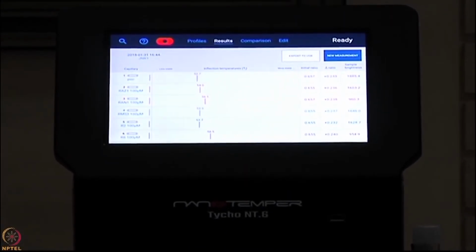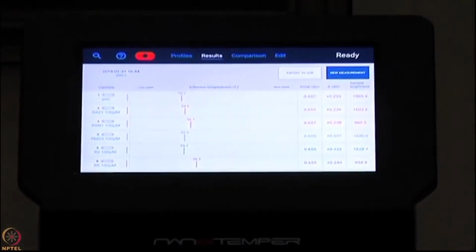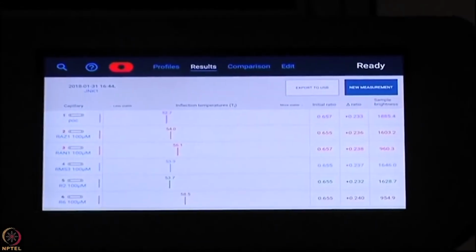So that is the biggest advantage. Another thing is you are seeing the stability of your protein. Many times you purify the same protein over some months or something like that. So you can always compare what is the profile similarity, what is the percentage loss I'm seeing here. So all these things you can integrate in your workflow to measure the protein stability.